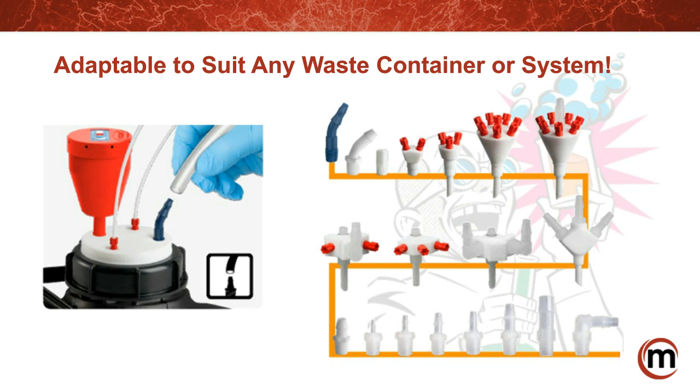Another question, does the lifetime of the red part of the waste cap depend on the type of solvent used with the HPLC? Right. This was done under the worst conditions. They recommend 6 months, so it's recommended to change after 6 months because they did it under the worst possible solvent conditions. But again, it's just the recommended amount of time. The container isn't going to blow up if you don't change the filter. But it is good practice, as the activated carbon inside the filter will be essentially used up by all the vapors that it would contain over the course of 6 months.